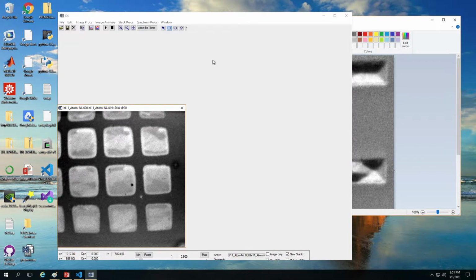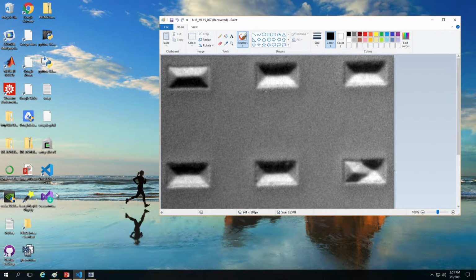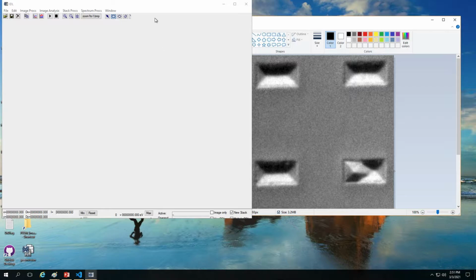Hi everyone, so now we are gonna look at how we could generate the low resolution and high resolution PEEM image pairs with this PEEMVision software. So let's go to the remote server and then click to continue. Okay, so one thing you want to do every time you open the software is to use ROI for alignment.